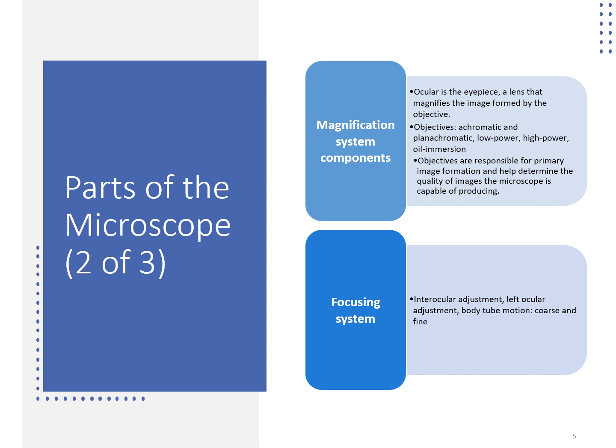The focusing system is your ability to fine focus or coarse focus in on objects. It has to do with the depth you are away from your oculars and making sure that you adjust those oculars to fit your eyes. These are things that we will learn and go over when you're doing your campus lab.